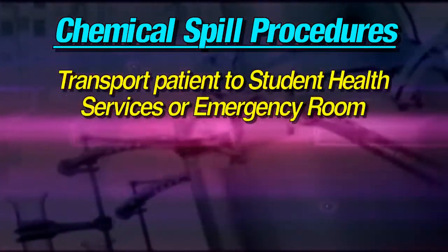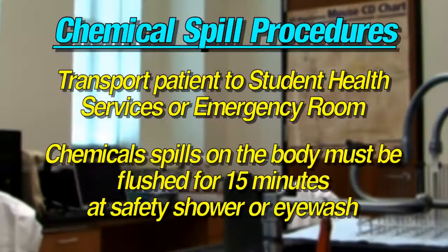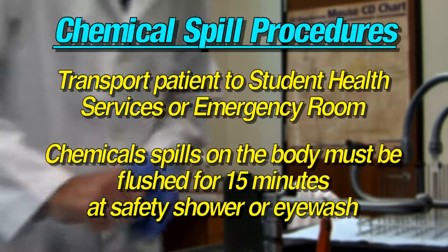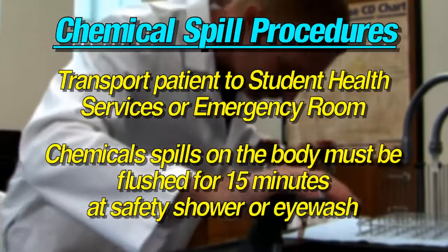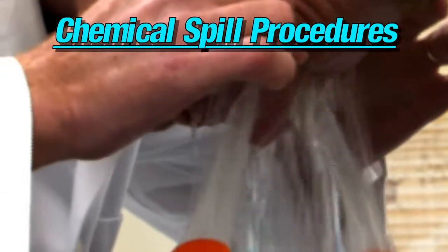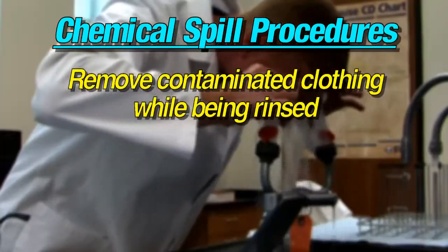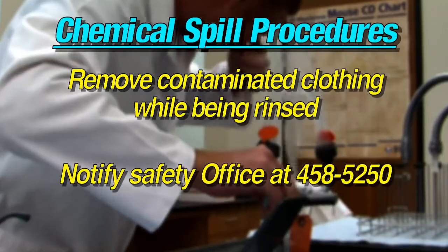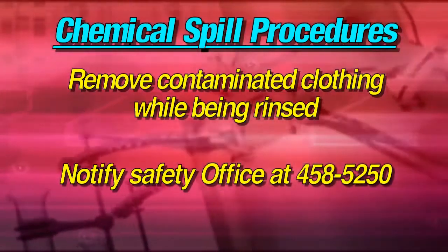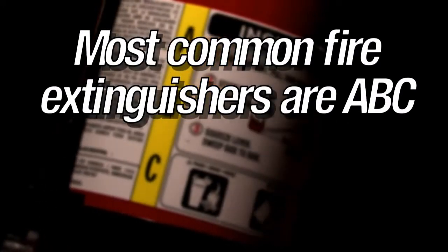Transport patient to Student Health Services or emergency room. If the spill is on your person, flush appropriately with copious amounts of water for at least 15 minutes at the nearest safety shower or eye wash. While being rinsed, remove all contaminated clothing. Notify the safety office at 458-5250.